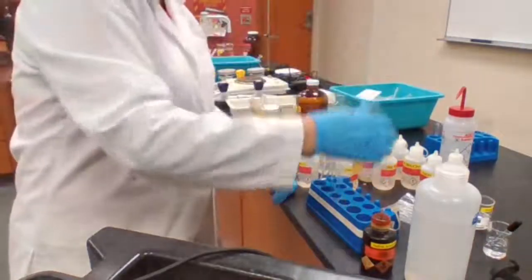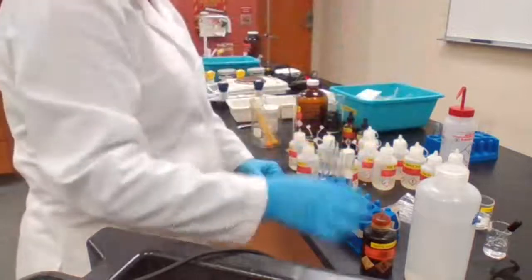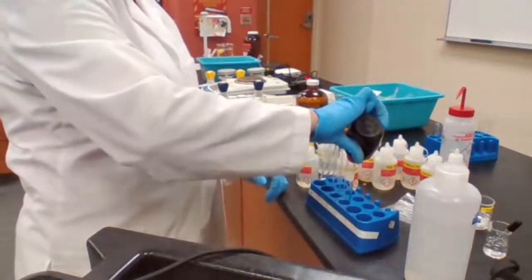Okay. It's yellow color, but I don't see the precipitate yet, so it has to form a solid. It should turn cloudy.